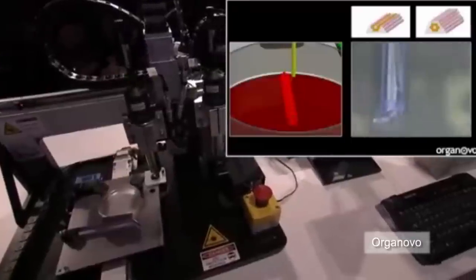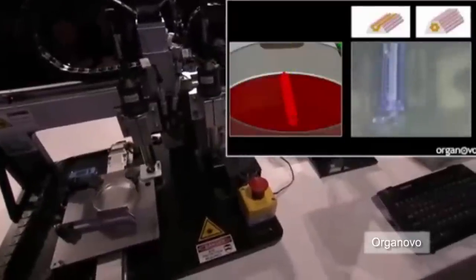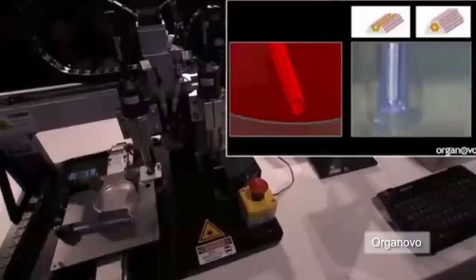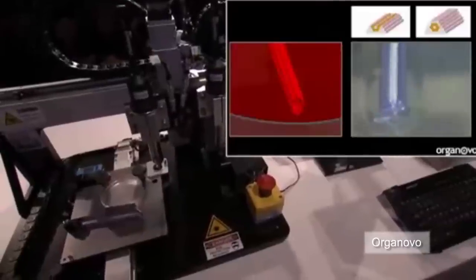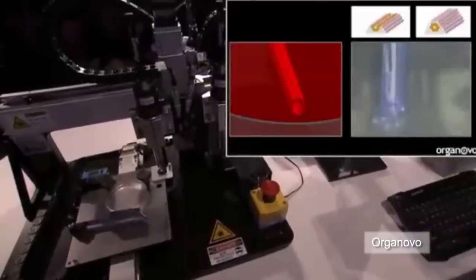San Diego-based company Organovo has developed a bio printer that is making strips of liver tissue that could be used to test new drugs before they are administered to humans.